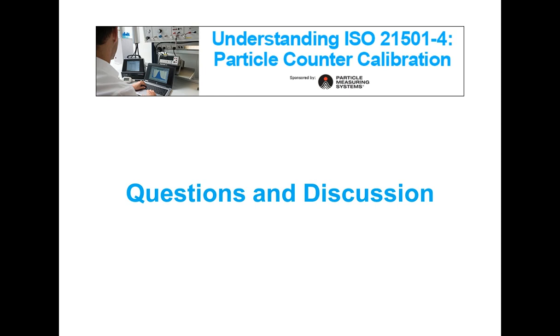A typical life of the laser diode may be around 7, 8, 9 years, but mostly depends on how you use the particle counter, the environment, the temperature, the moisture and humidity, and also the frequency of use.